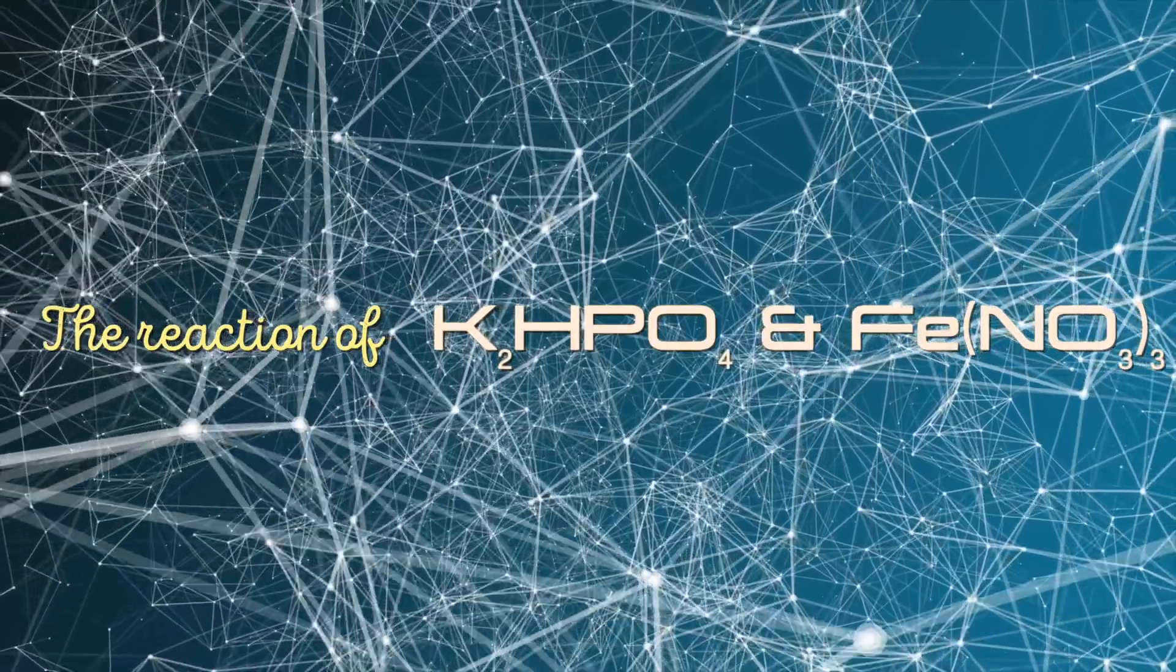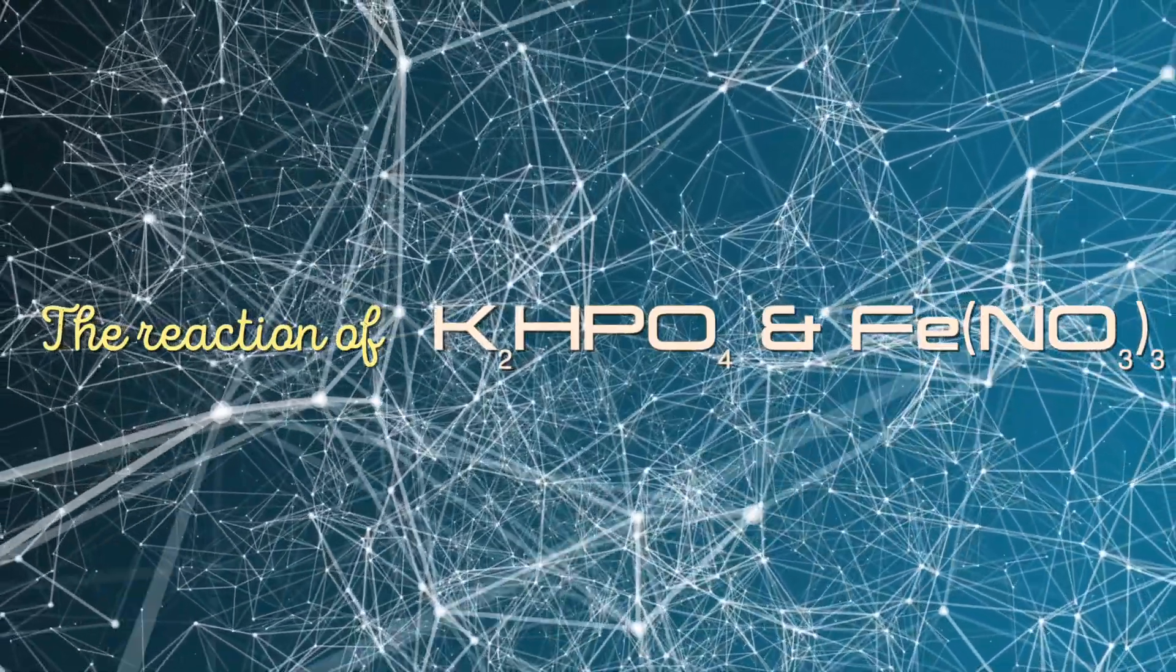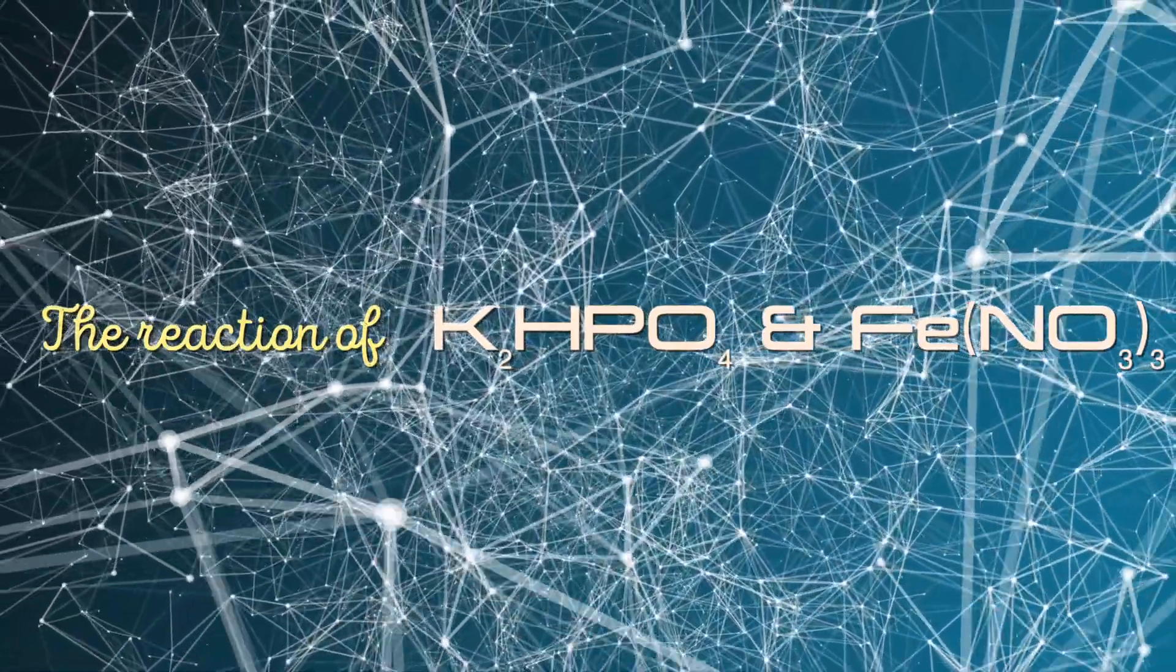Today we are going to observe the chemical reaction between potassium phosphate and iron three nitrate.